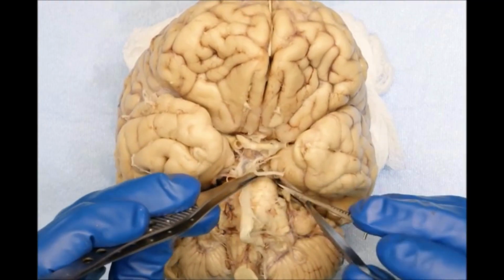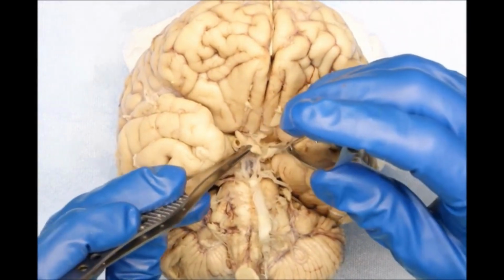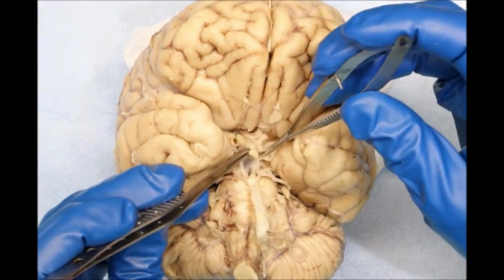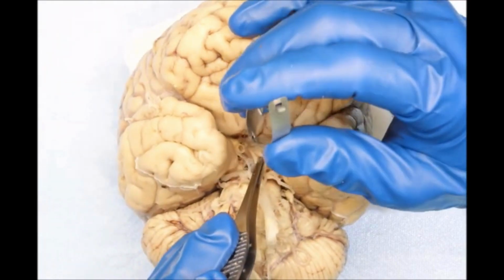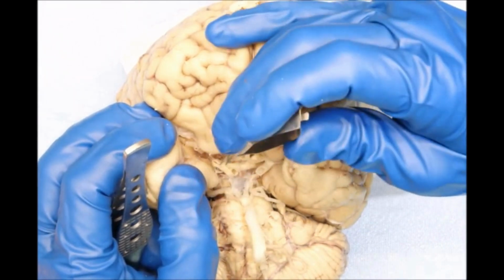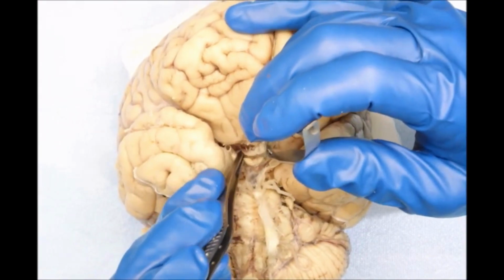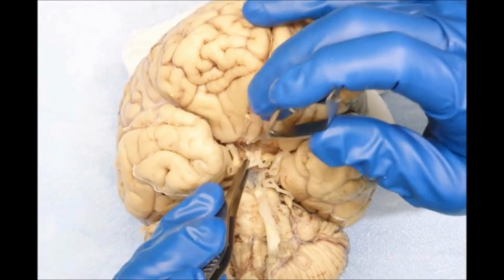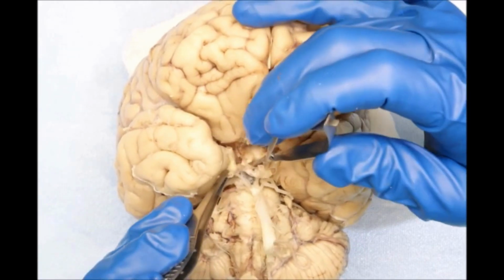And that's the process of just finishing up the deep thread-like branches in this area. I'm holding on to the left optic nerve. I'm now pushing it underneath the anterior cerebral arteries. I'm going to try to really free up the circle of Willis now. Pushing the optic nerve down, pulling the anterior cerebral arteries towards me.